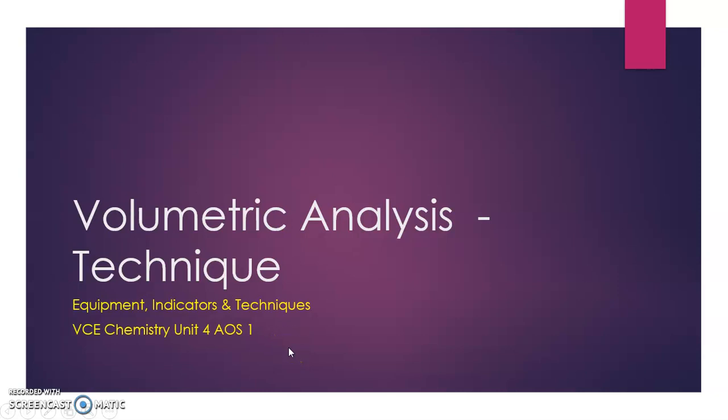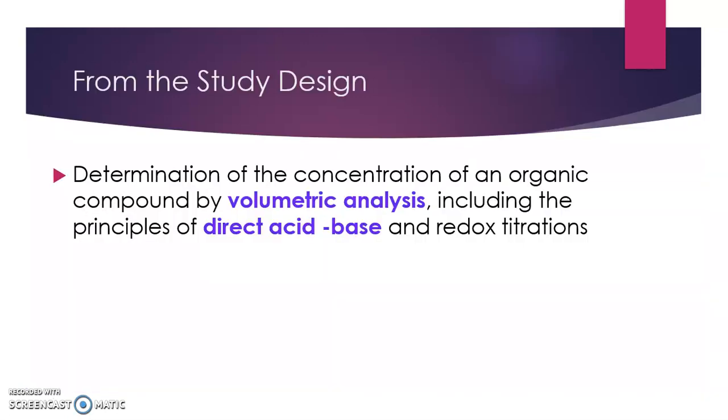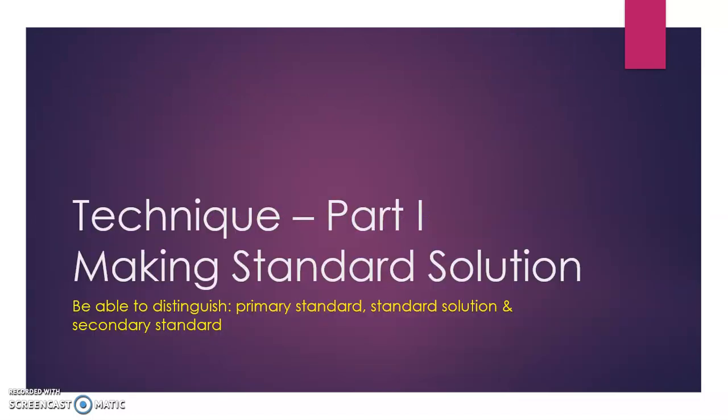VCE Chemistry, Unit 4, Volumetric Analysis, Technique. In this session, we'll focus on the techniques of volumetric analysis in terms of its experimental procedure, and we'll focus on the direct acid-base titration that we have learned in Unit 2. Technique Part 1, Making Standard Solution.